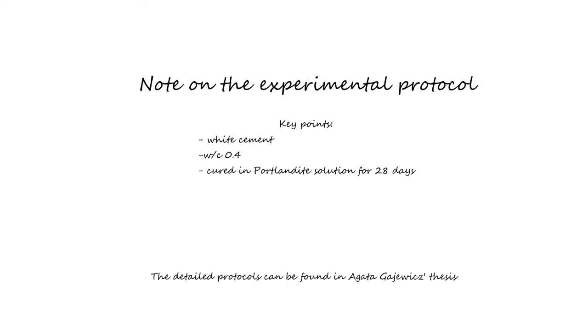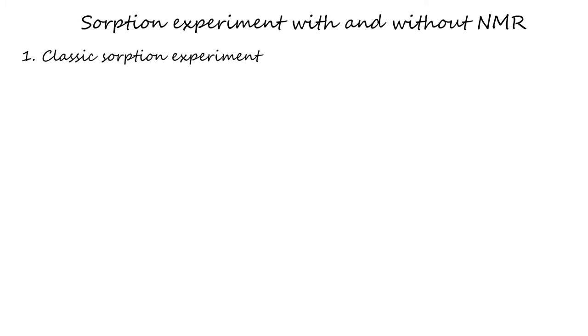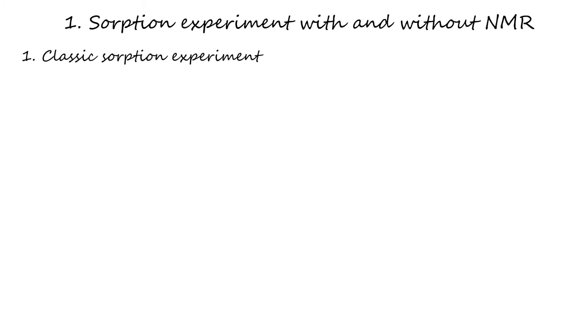We have already discussed how simple an NMR experiment is to perform in the video NMR-I, how to perform the experiment. We consider a classic sorption experiment before we see how NMR can be used to elucidate the interactions between cement paste and water.